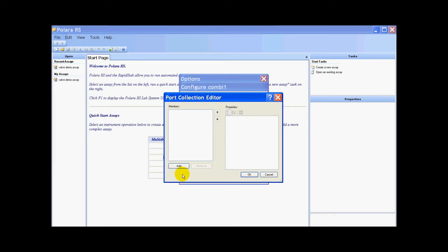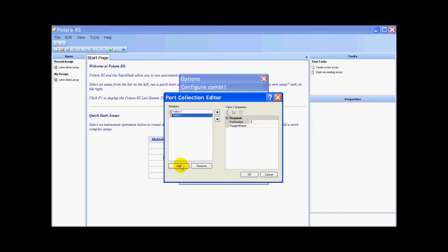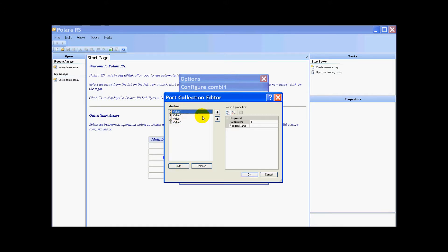Because I have a four port valve, I'm going to need to add four ports to my system. I just do this by clicking add four times. One, two, three, four. We need to give each of the ports a unique number and a unique name.